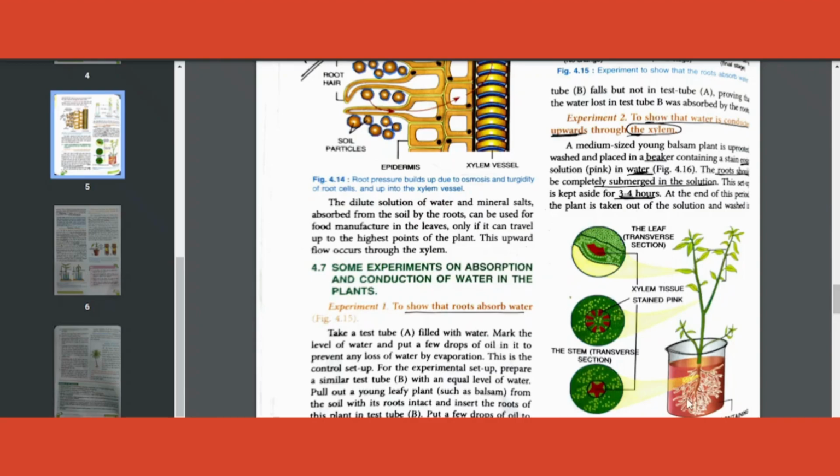First take a beaker, add some water into it, and add a clean plant into it. Clean, what do I mean by clean again? Clean, the root should be cleaned without any soil. And if you want to observe something in a little colorful way, water alone is useless, isn't it? We need to have some color in it. How do you add color? You can actually add some ink into it and still prove it.